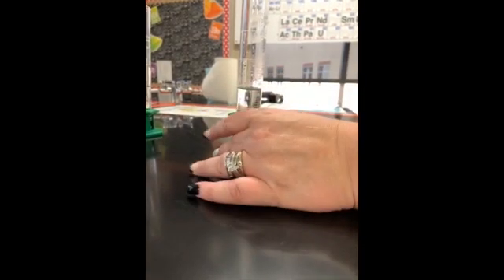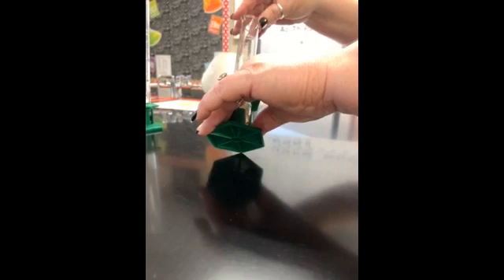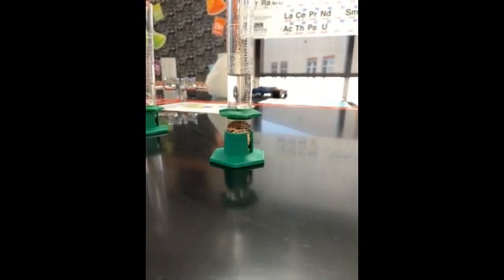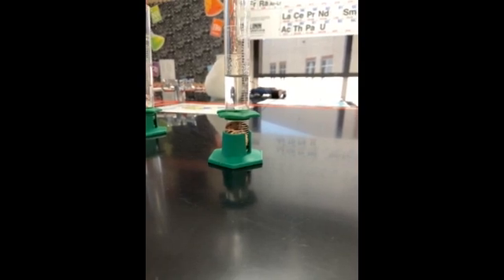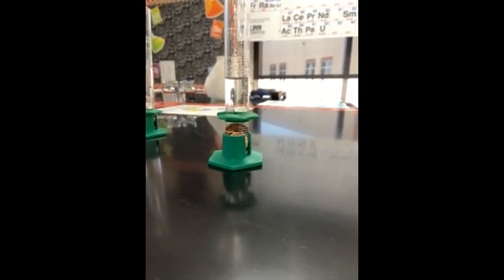All right, last trial, trial number 4 of the post 82 pennies. Graduated cylinder looks like 28.99. It's just under that 29 mark. Add my pennies. And we are now at 32 on the nose, so 32.00.